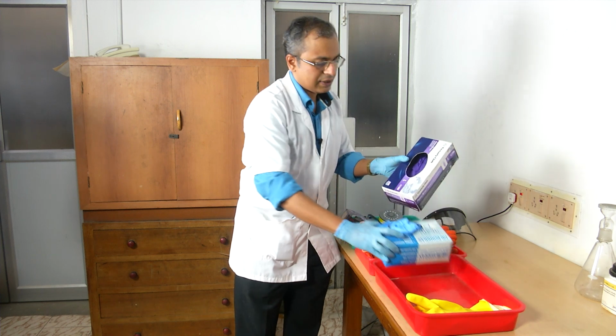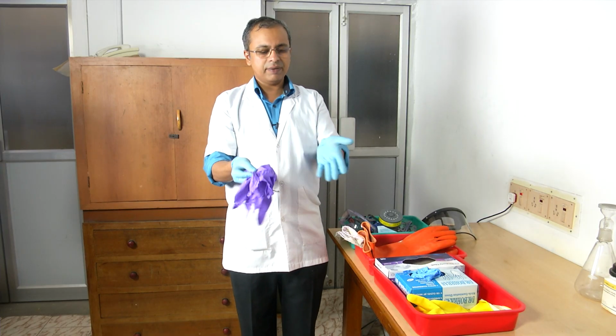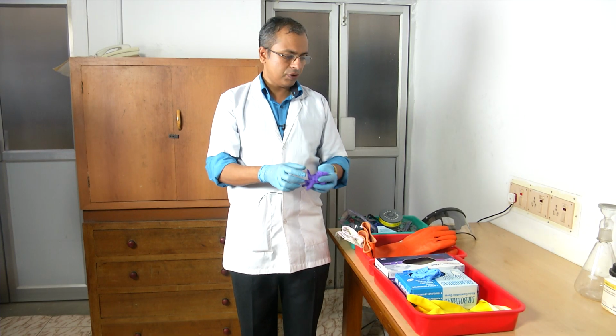These are other forms of gloves that are commonly available. This is also a pair of nitrile gloves. They are just simply different versions of what I am currently wearing. Different sizes, different thicknesses and so on are available, and they do provide you with a fair bit of safety.